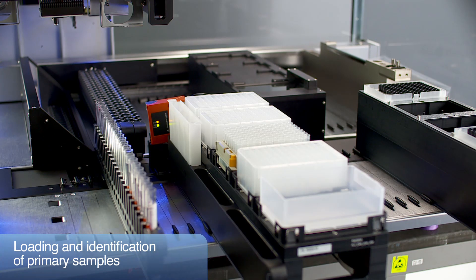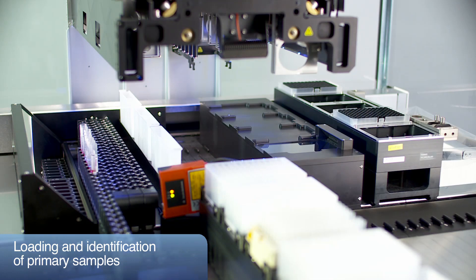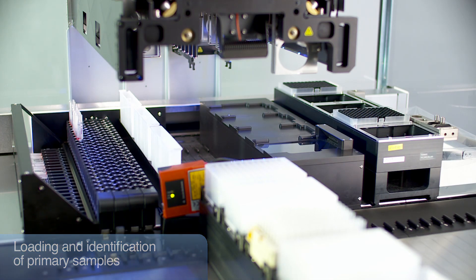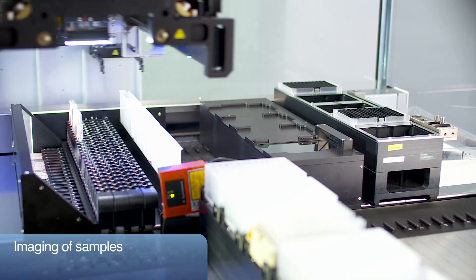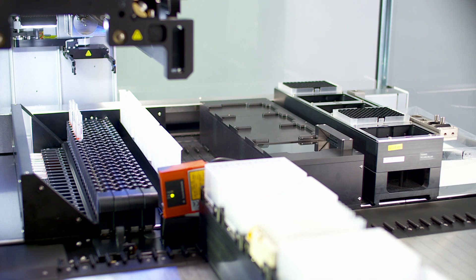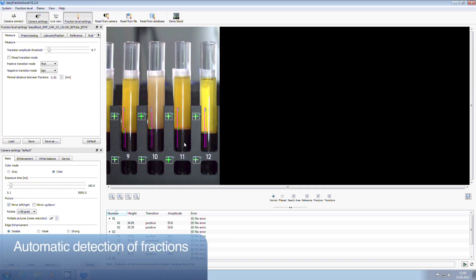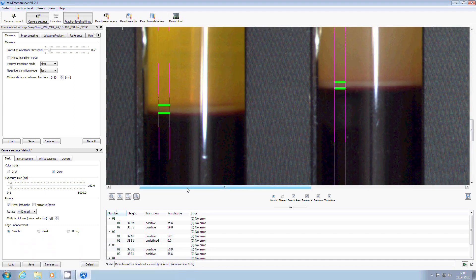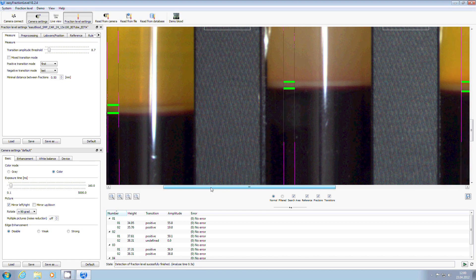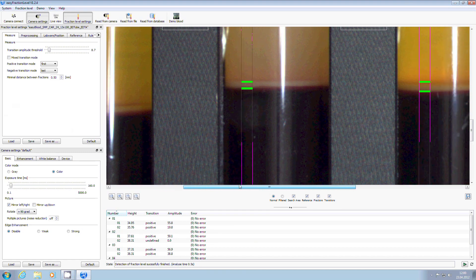The system automatically loads centrifuged and decapped samples in up to eight carriers at once while verifying the barcode and, if necessary, communicates with an LIS for data exchange. The high-resolution camera images four tubes at a time, and the EasyFraction Level software performs the analysis based on various customizable settings to ensure the highest detection reliability.